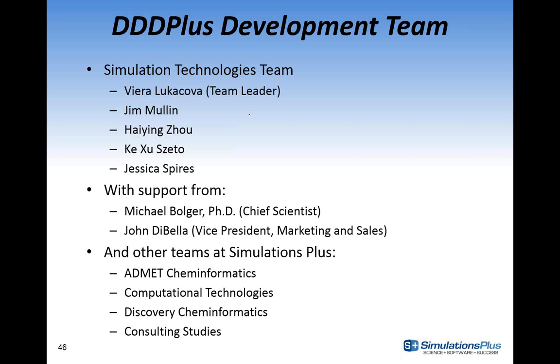It's not released yet, so we still have the opportunity to add physics to our CR model. So I'll definitely look into adding that. But we do have internally a working CR multi-particulate model. It's just not at a level yet which we felt comfortable releasing it. So in the next version, we'll have a multi-particulate model for CR coated bead formulations. So until then, no, but that's on the horizon as well.